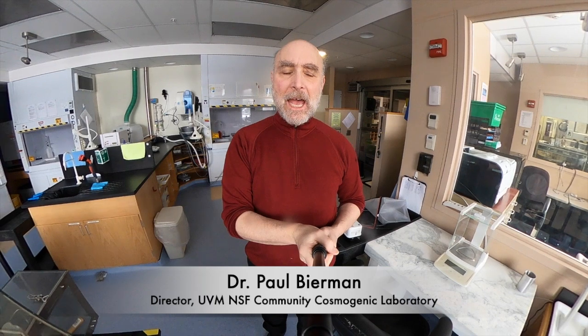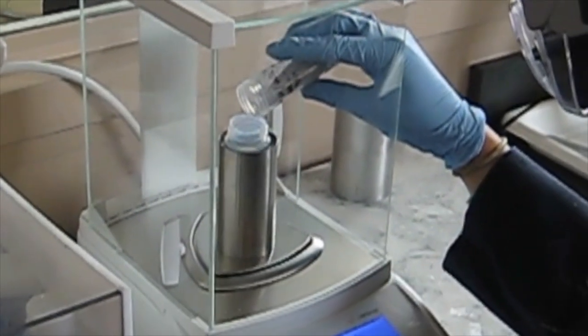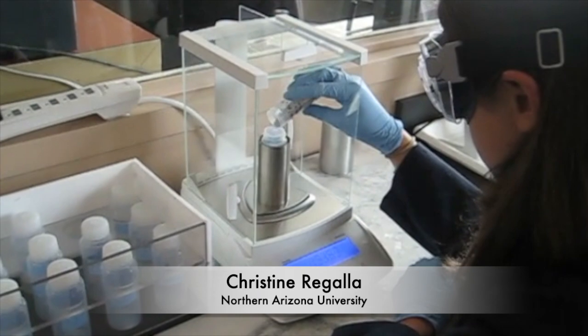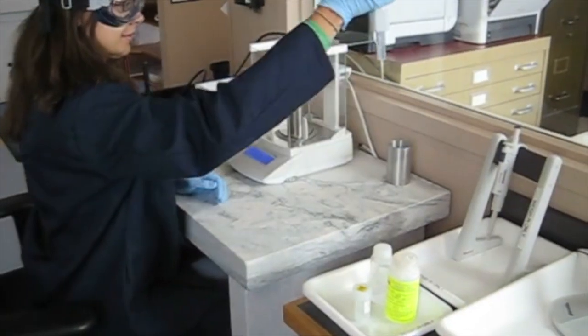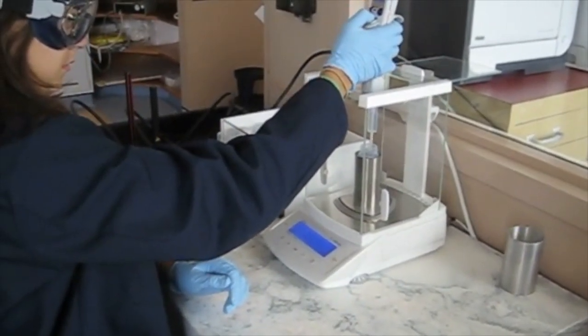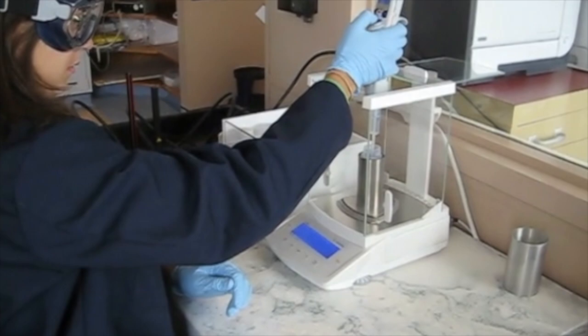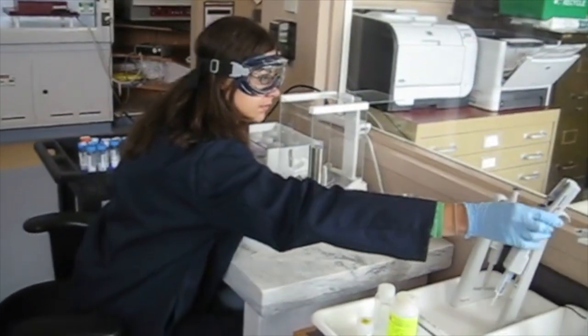In this video segment, we're going to talk to you about how we mass in quartz and how we add carrier. We mass in quartz and we add carrier because we're doing an isotope dilution experiment. We need to know the mass of quartz because all of our measurements are referenced to atoms per gram of quartz. And we need to add carrier because there's very little native beryllium-9 in quartz. And although there is some aluminum-27 in quartz, the stable isotope of aluminum, there's often not enough for our process.